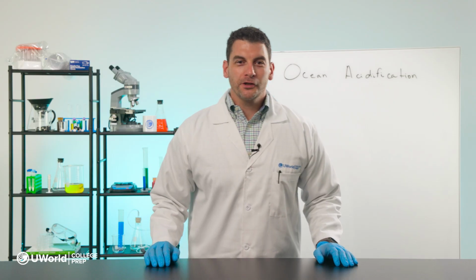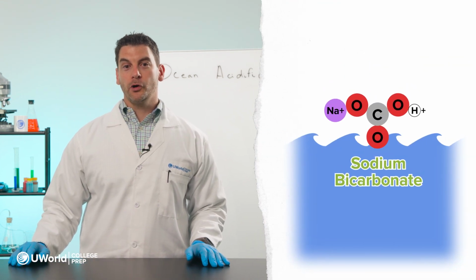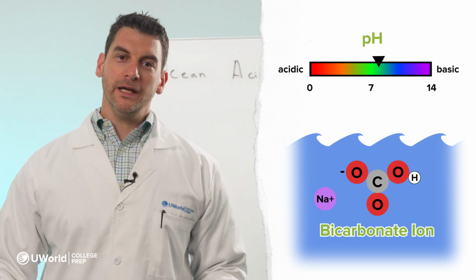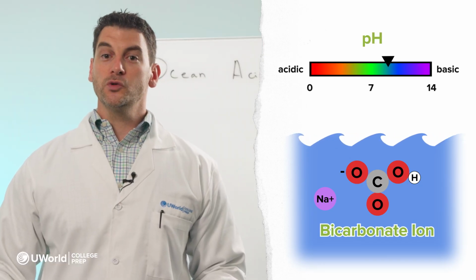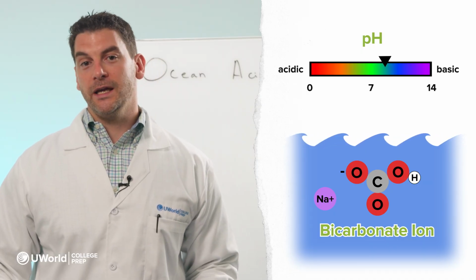In this lab, we'll measure changes in pH in various water samples exposed to CO2. Then at the end, we'll add some sodium bicarbonate, a chemical that dissolves to create buffers, which will increase the initial pH as well as buffer the solution, which should limit changes in pH.